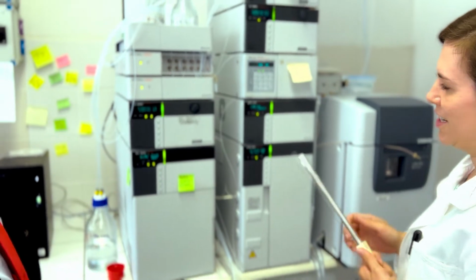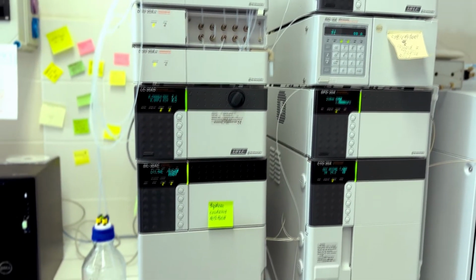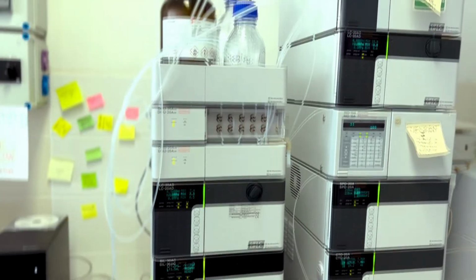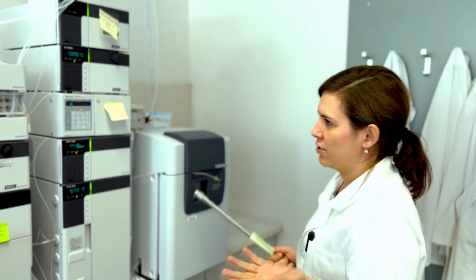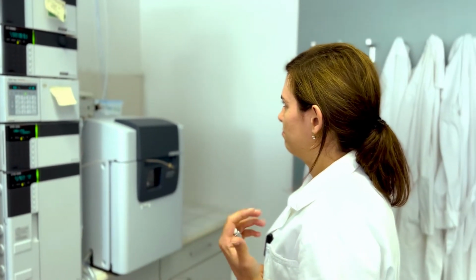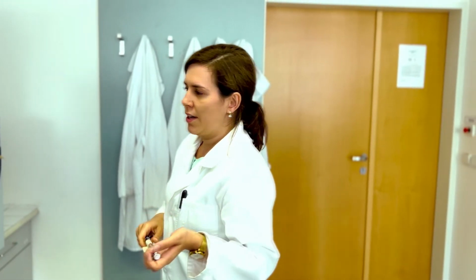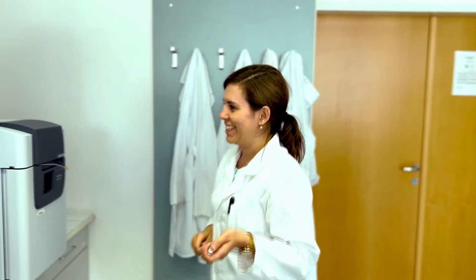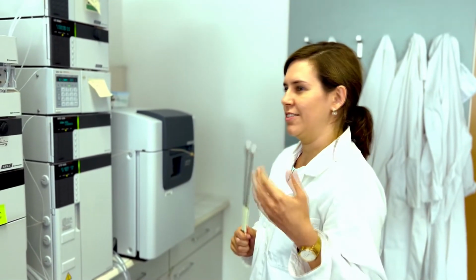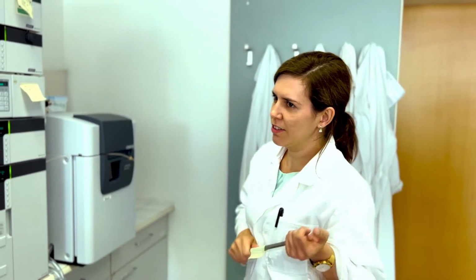When we put it inside, we can measure using this HPLC and gel permeation chromatography the molecular weight of different biomolecules, hydrolyzers. So what is the longest molecule you can measure here? It depends on the biomolecules. For example, hyaluronic acid, we can measure 1 million daltons. Regarding protein hydrolysates, it's only about 1,000 daltons. The shortest is approximately 500 daltons.